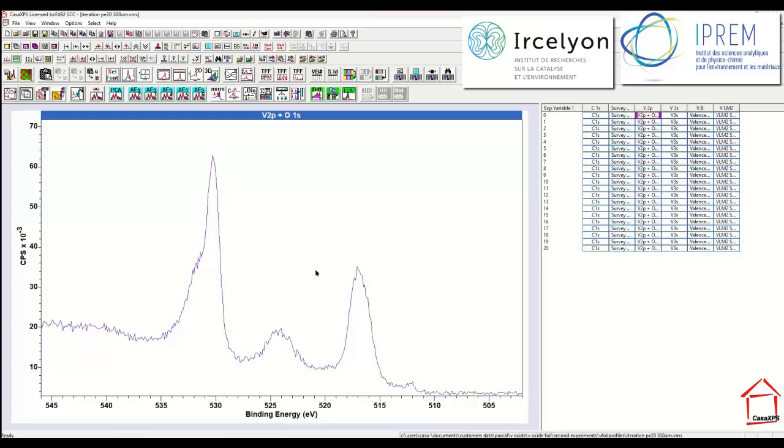In this video I'm going to consider vanadium 2p. Previously I used regions to construct a peak model that just targeted the vanadium 2p, but now I will use only one region and a set of components that will allow the construction of a background over this interval that ought to be very similar to the one that I ultimately used to fit these data, where I excluded the oxygen 1s using a region with a background type of null.